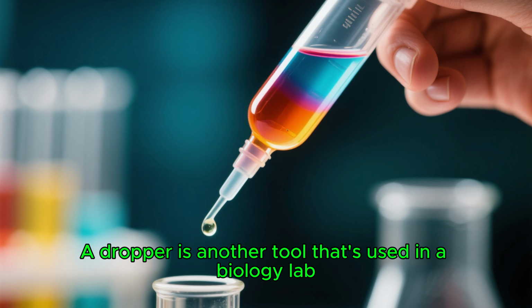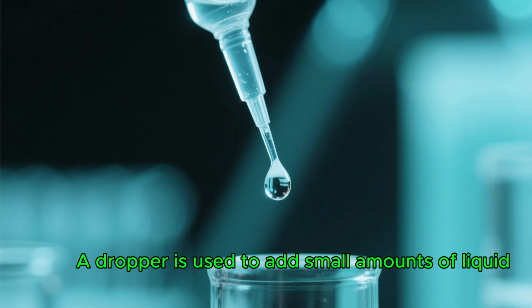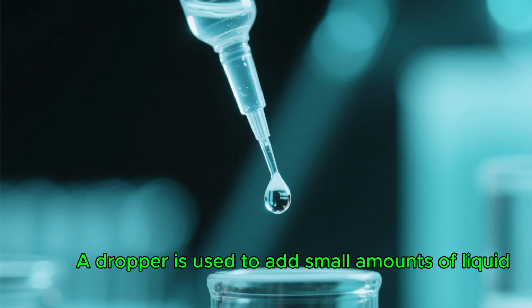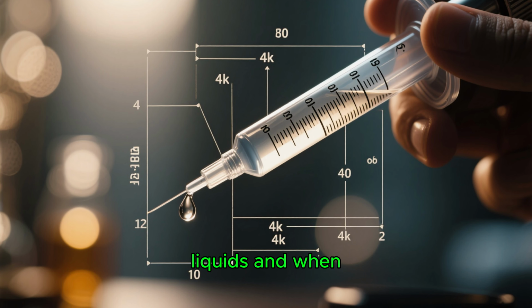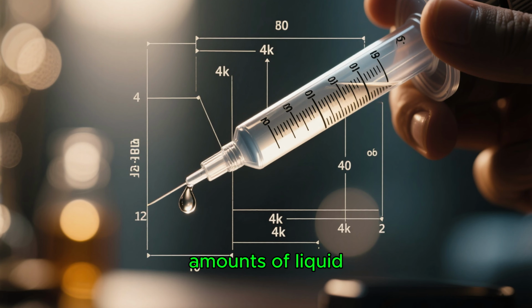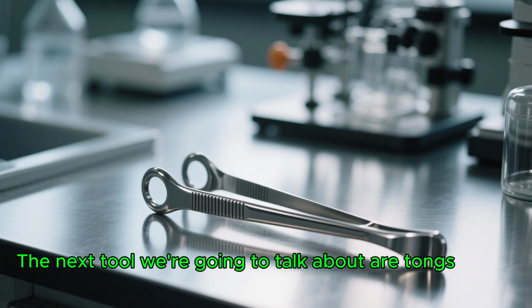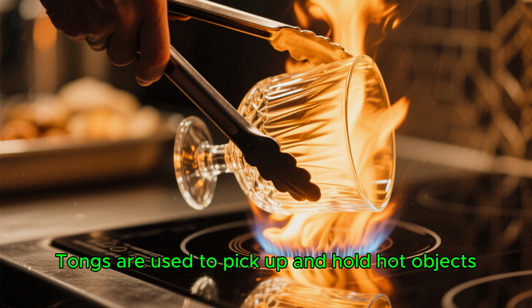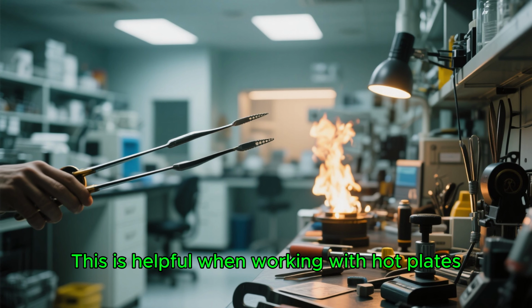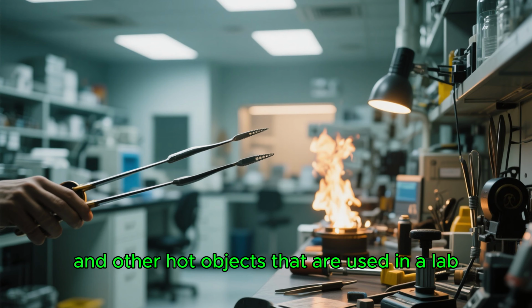A dropper is another tool that's used in a biology lab. A dropper is used to add small amounts of liquid. This is helpful when working with small volumes of liquids and when adding precise amounts of liquid to a sample. The next tool we're going to talk about are tongs. Tongs are used to pick up and hold hot objects. This is helpful when working with hot plates, hot glassware, and other hot objects that are used in a lab.